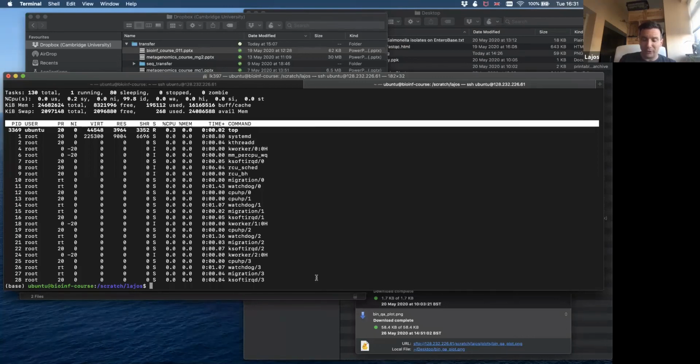When you get back your whole genome sequencing data, you have these two choices. If you want to build up your own genome by using de novo genome assembly, or if you want to build up your genome based on a known reference sequence.